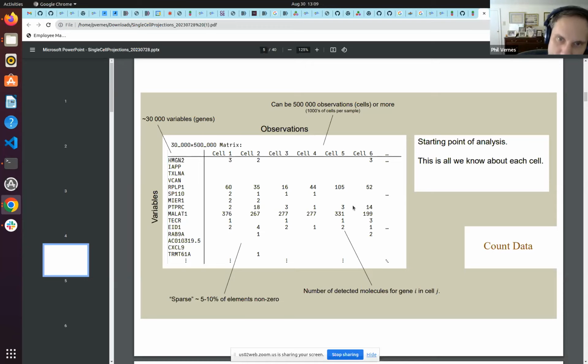So again, concretely, in the data structure for the count data for a given sample, each column is a cell, each row is a gene, and you have the counts here. You will then furthermore have a separate table for each cell and for each gene, also in that data matrix object.